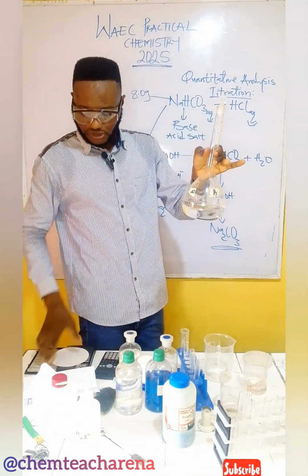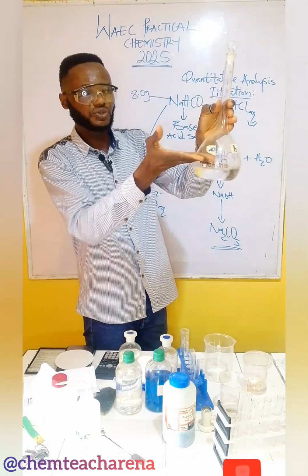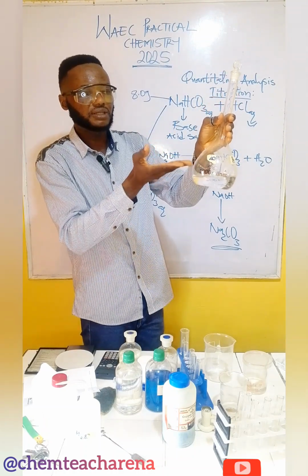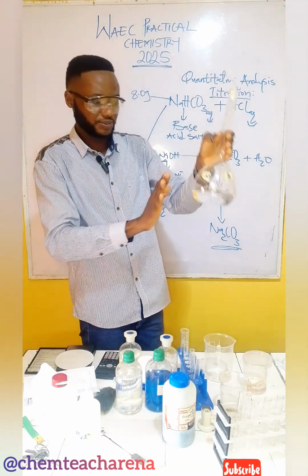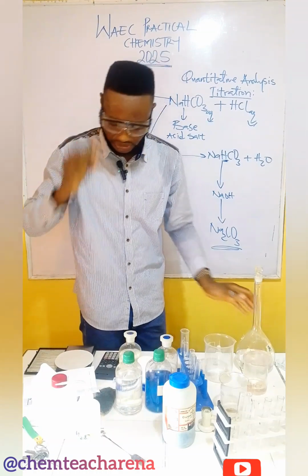Then before you start weighing, you have filled this 1000 ml with distilled water. You know it is 1000. You can measure 500 here. Keep it after you have poured 500 distilled water there. Then what do you do next?